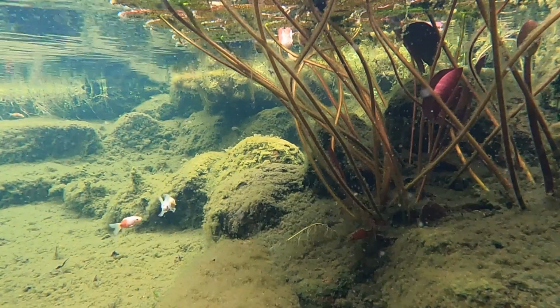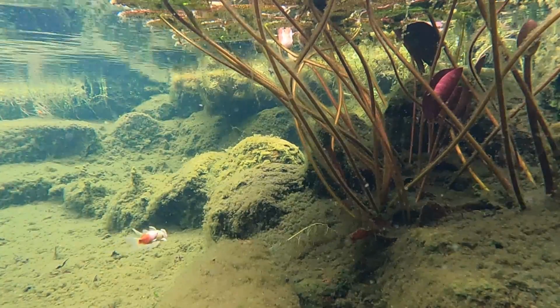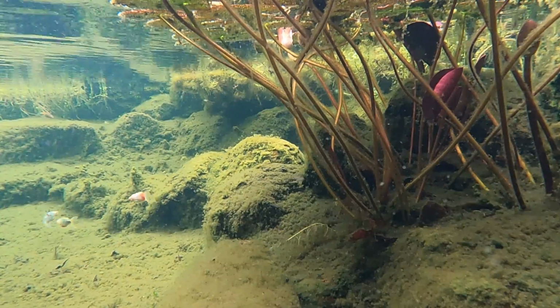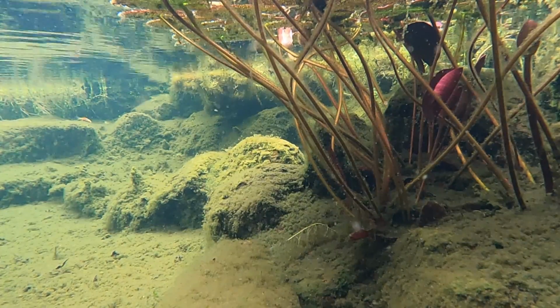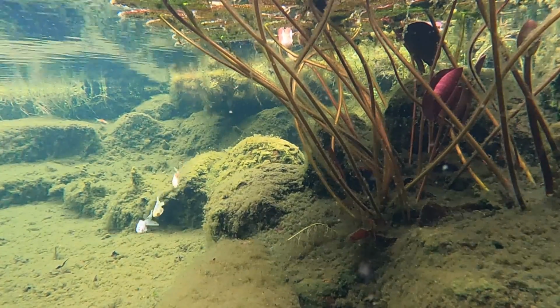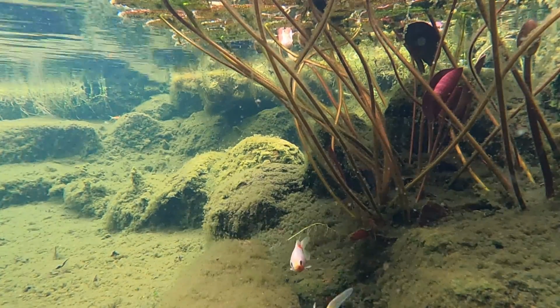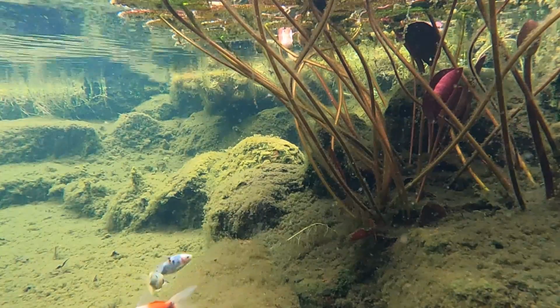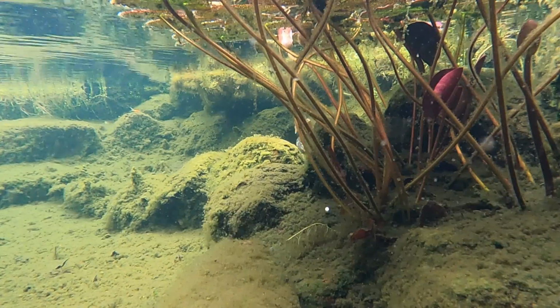The things that it measures are useful, but they don't tell the whole story on how healthy or unhealthy the water is. I think it'd be a useful unit for someone with a dedicated koi pond or a saltwater aquarium. I hope to have a reef tank one day. Koi still remain illegal where I live. It'd also be handy for anyone that's catching fish out in the wild and wants to quickly check water parameters.